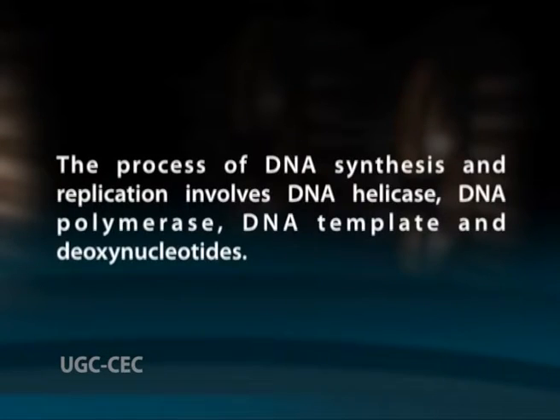Later, the method was performed using automated sequencing machines in which the truncated DNA molecules labeled with fluorescent tags were separated by size within thin glass capillaries and detected by laser excitation. The process of DNA synthesis and replication involves DNA helicase, DNA polymerase, DNA template and deoxynucleotides.